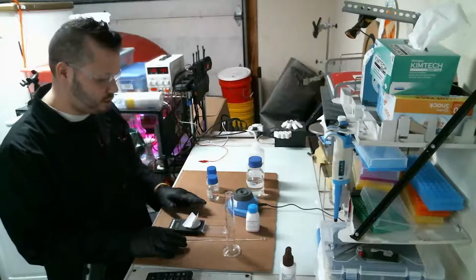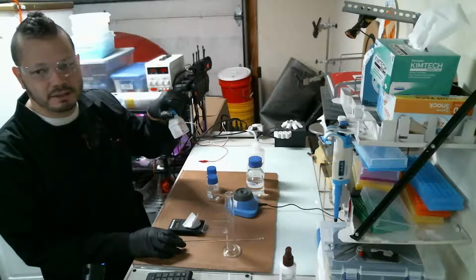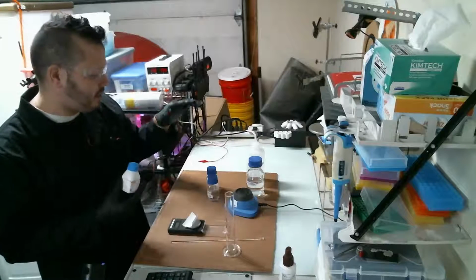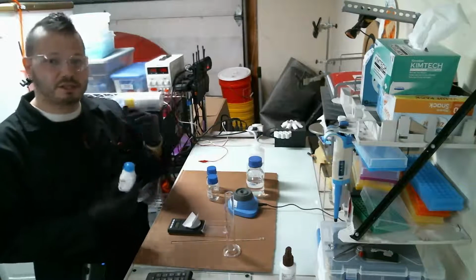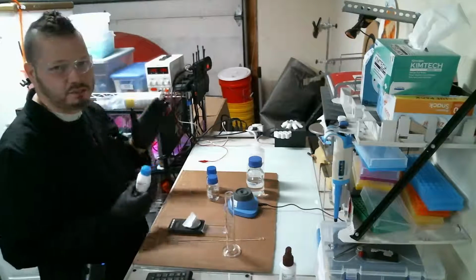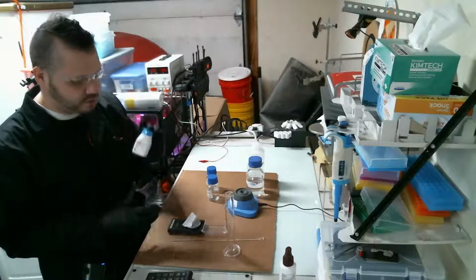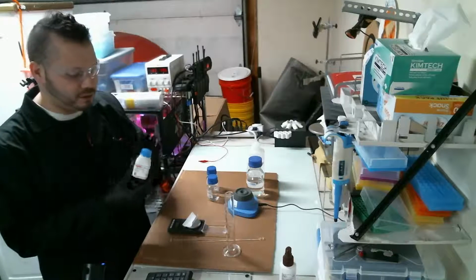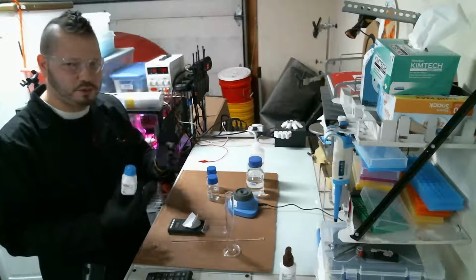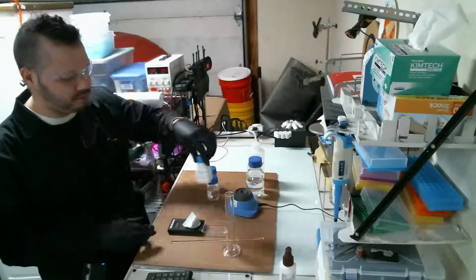Hello everyone, so today I'm going to be making a Naphthaleneacetic Acid solution and a control solution for my algae experiment. What I'm really going to be doing is explaining exactly what the algae experiment is while I do this. First, Naphthaleneacetic acid is a synthetic version of indole acetic acid, which is a plant hormone that promotes growth, and the direction of growth as well, of plants.